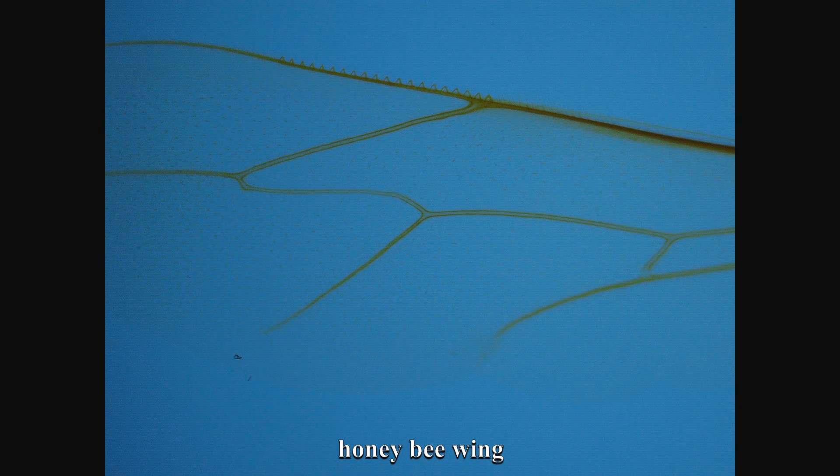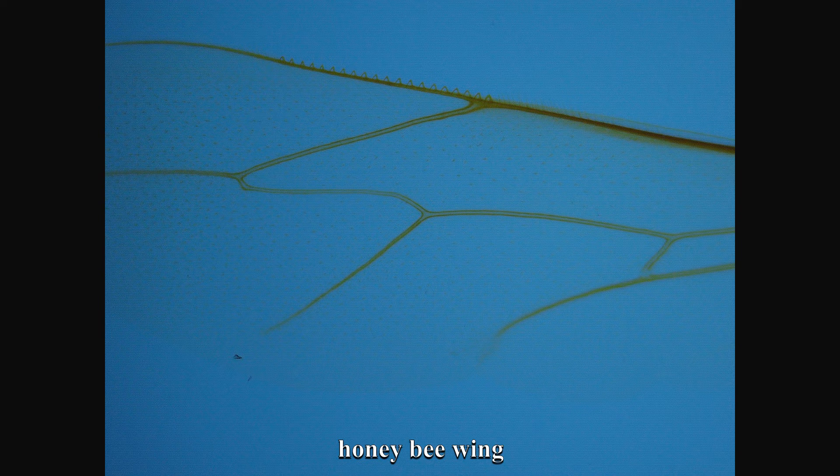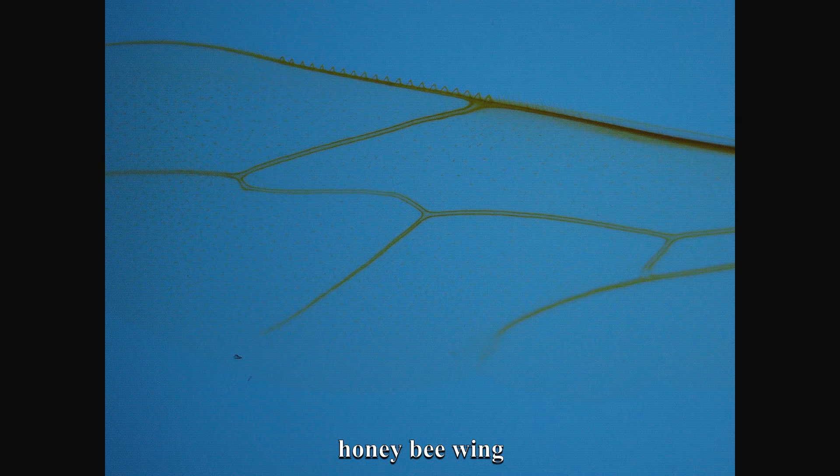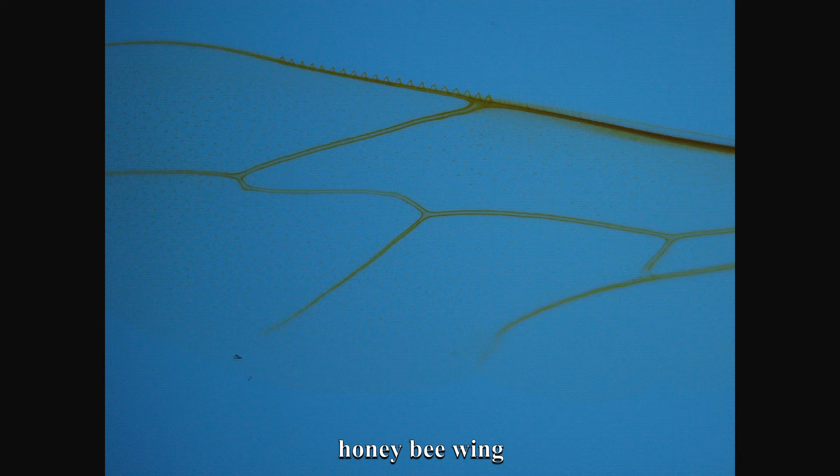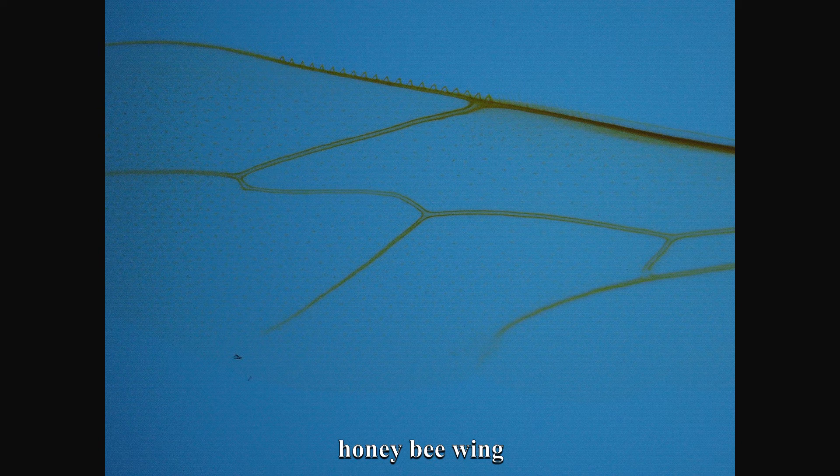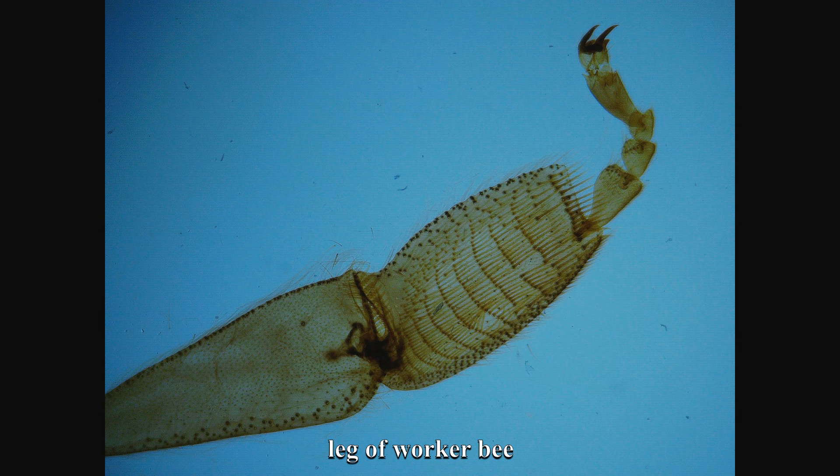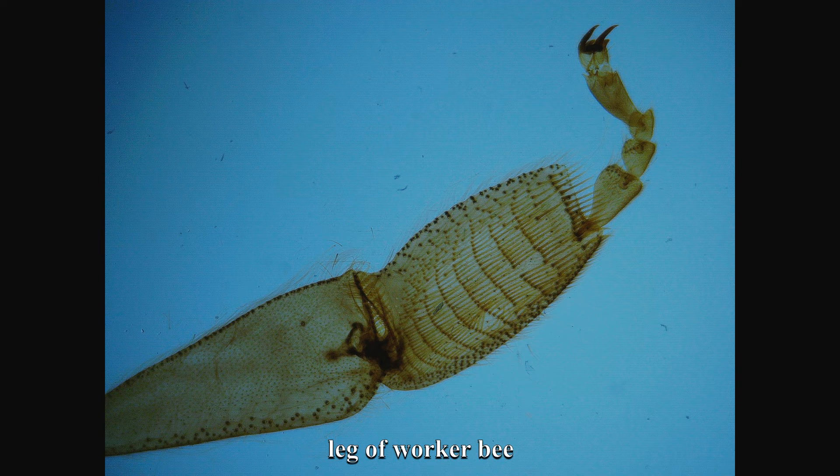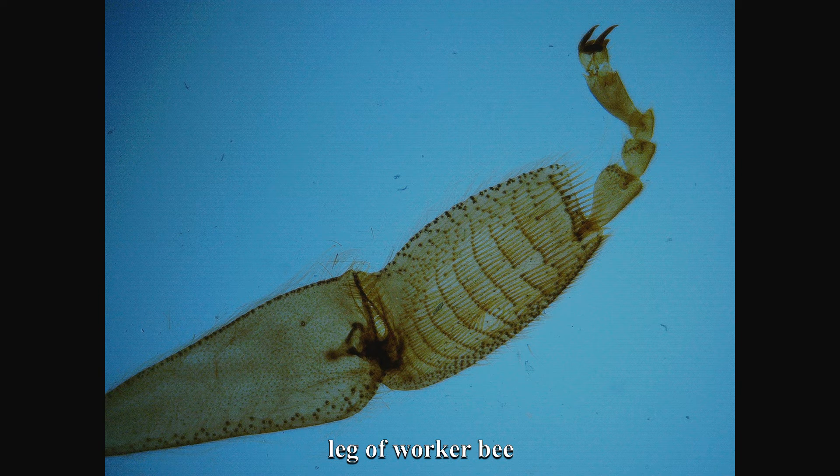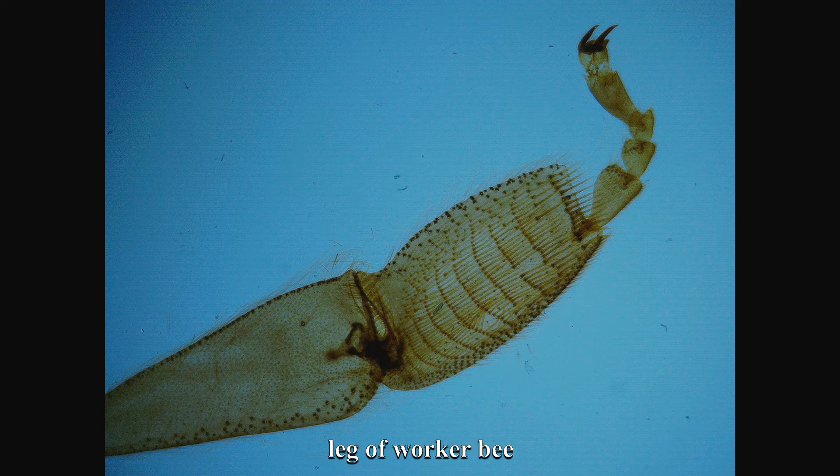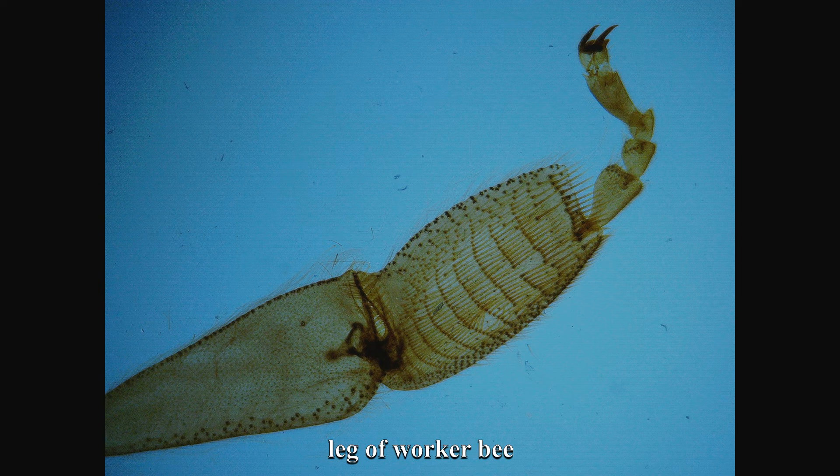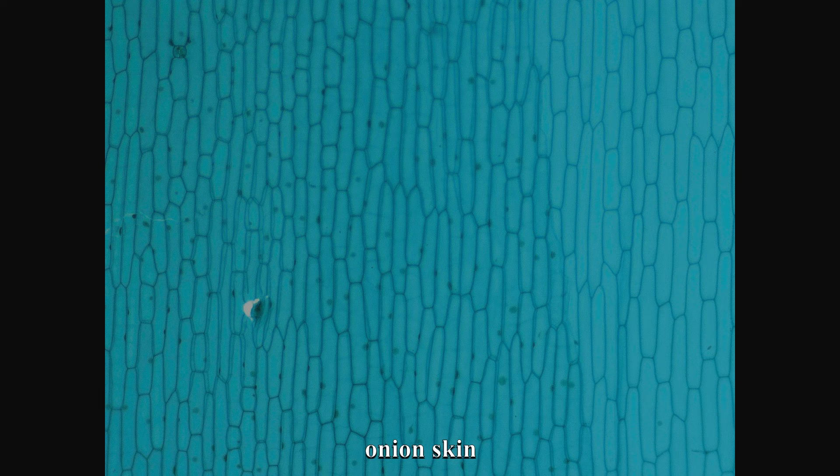In summary, this LinkMicro LM249MS is particularly suitable for working with not too high magnifications. Then the stability is sufficient. Fortunately, there is enough space under the lens to work comfortably, the most important advantage. It is less suitable for the highest magnifications, because this column and arm are not sufficiently sturdy and precise for this, but with some patience the finicky settings are manageable.